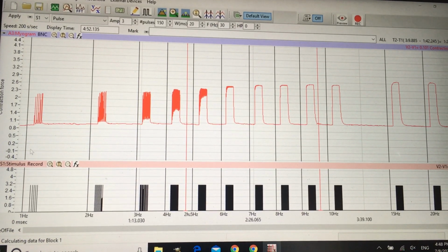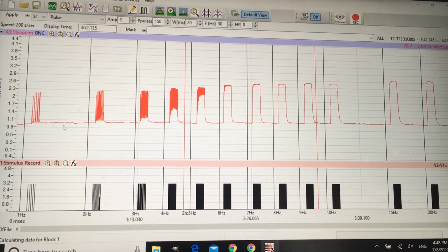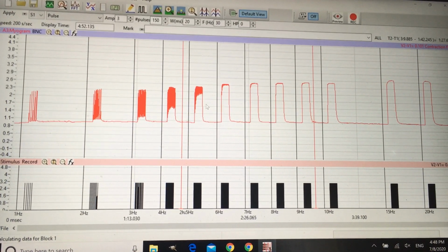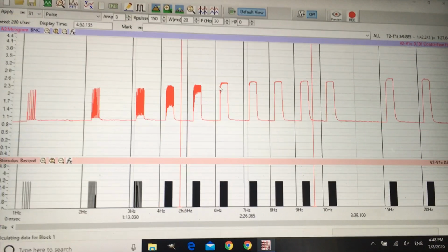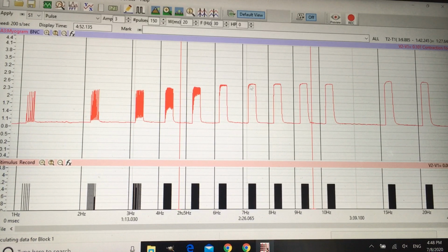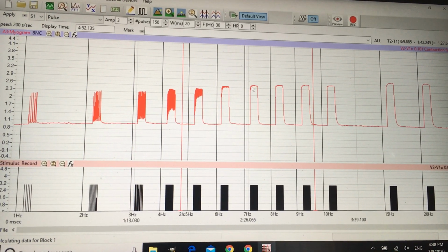When you have a low frequency stimulation, the muscle still has relaxation. When you gradually increase stimulation, they start to have a summation. Here you have a summation, and until you reach tetanus. So here you already have a tetanus, and tetanus is the maximal contraction. So maybe here, you already have a maximal contraction. For tetanus, we have the unfused and fused. Fused is the maximal contraction without relaxation.